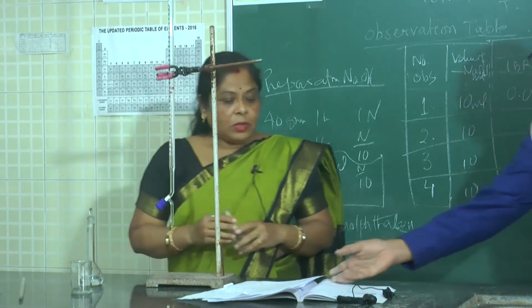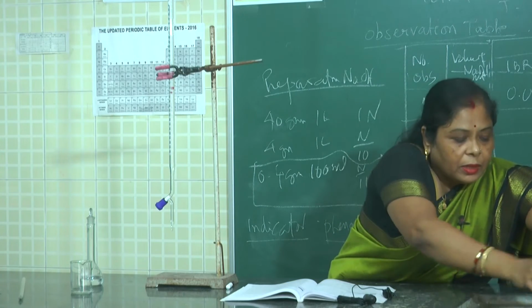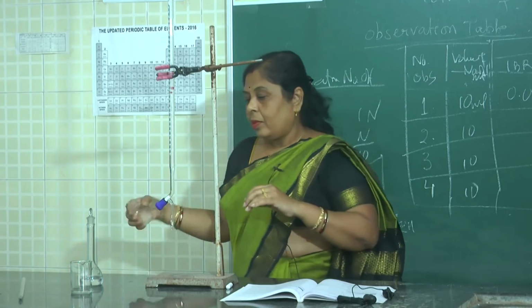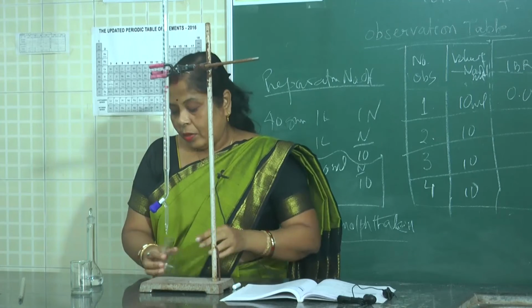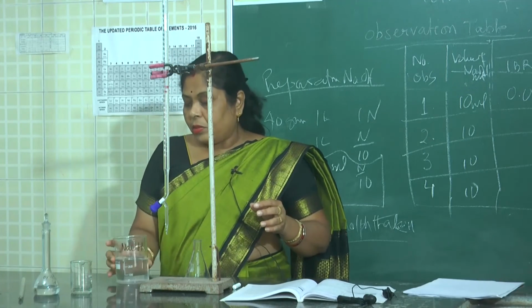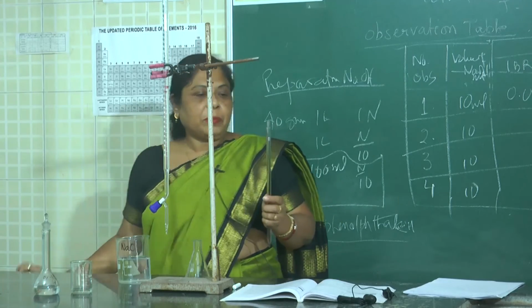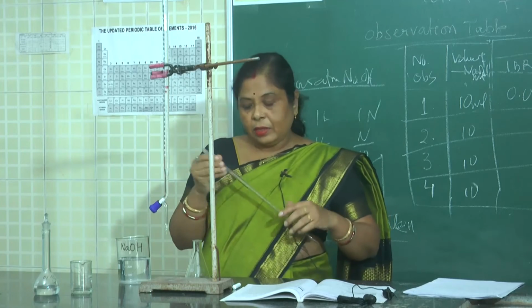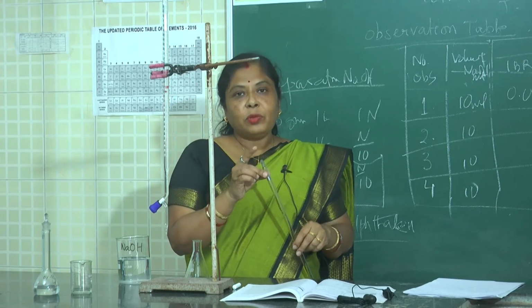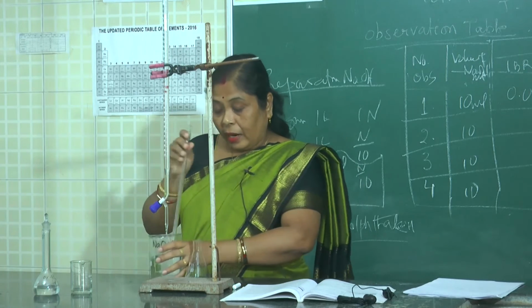Now the conical flask also we have to push in with one hand. Now for pipetting, already this NaOH solution is there. So this is your standardized NaOH solution. This is the pipette. And the most important aspect of pipetting is how to hold the pipette correctly. We have to hold it with these two fingers, and this index finger should be released so that you can adjust it.